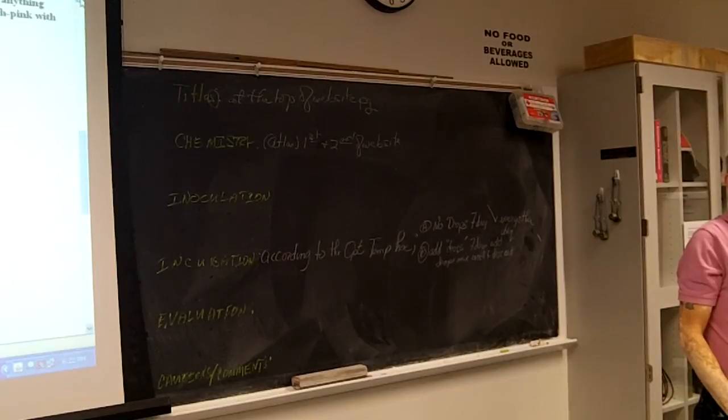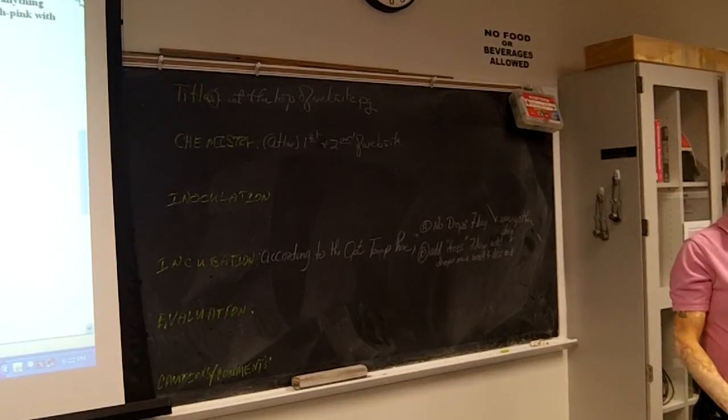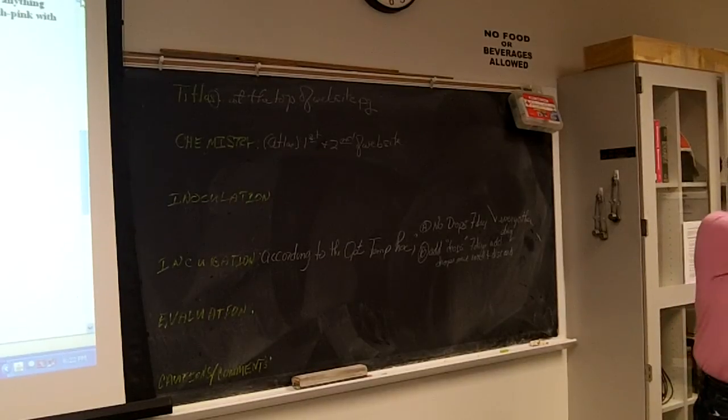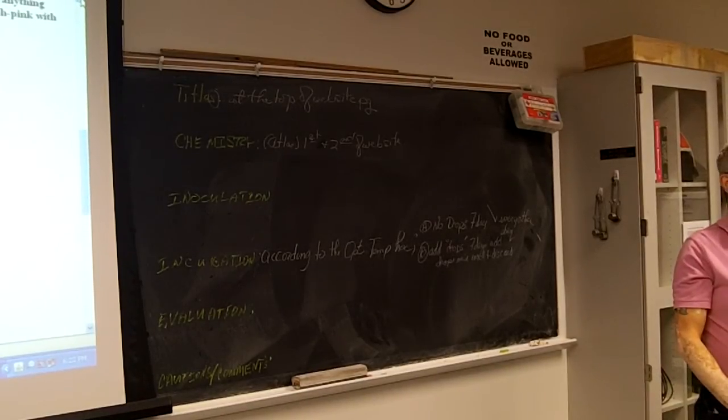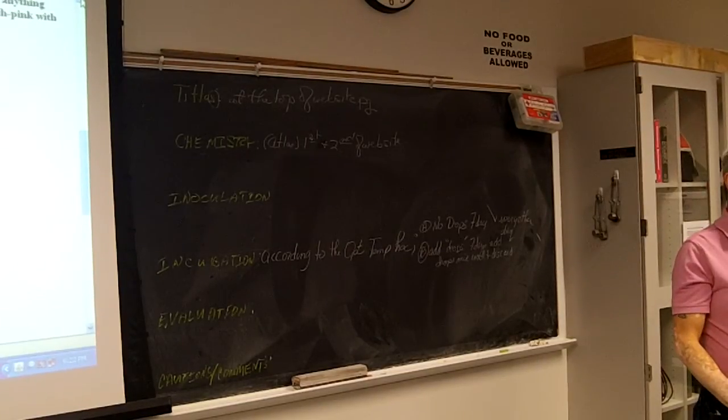There's only two options. If you don't add drops, you check it every other day for the right color. If you do add drops, you stick it in there and just leave it a week. Come back, add the drops, record the color, and discard. That's it. There are only two options.